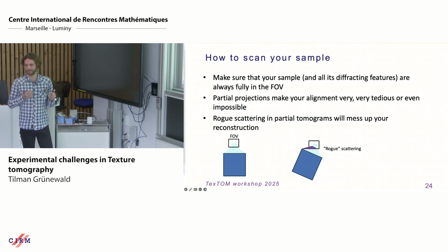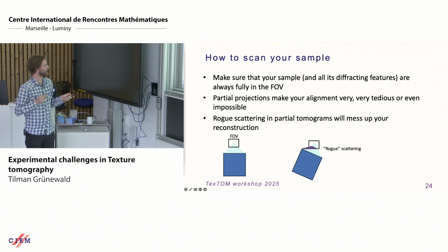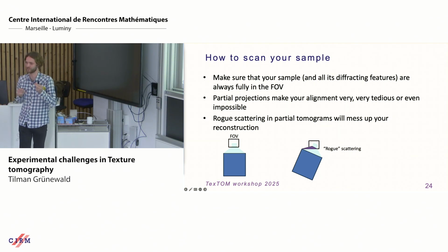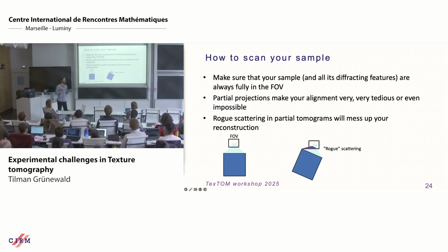One last note about sample. I know, I know. If you have this nice little pillar here, you need to make sure that your sample is fully in the field of view at all times. Otherwise, you really have a hard time in the alignment step.